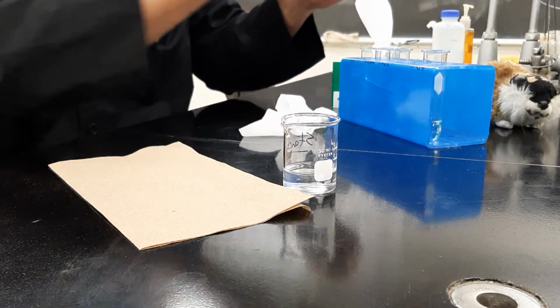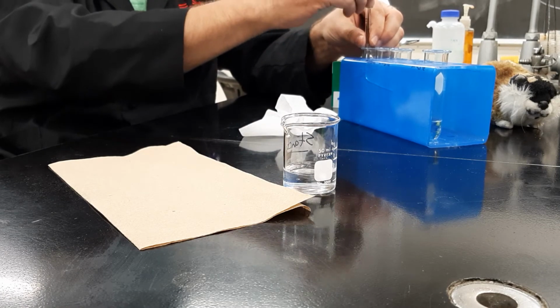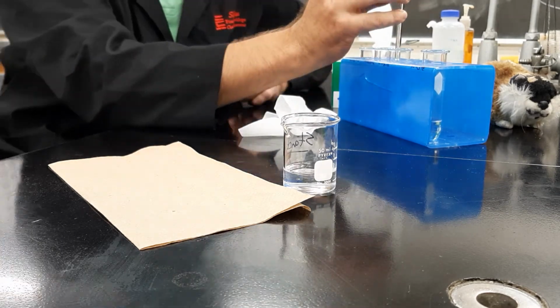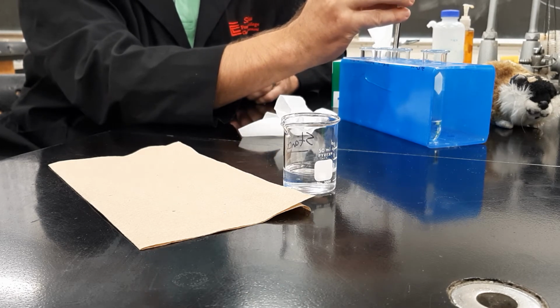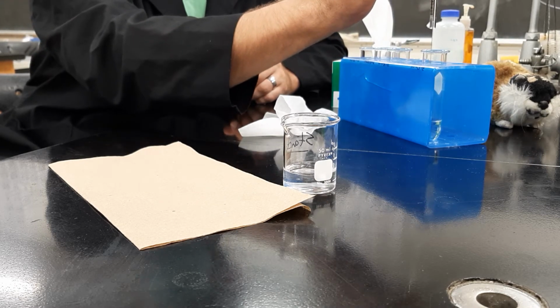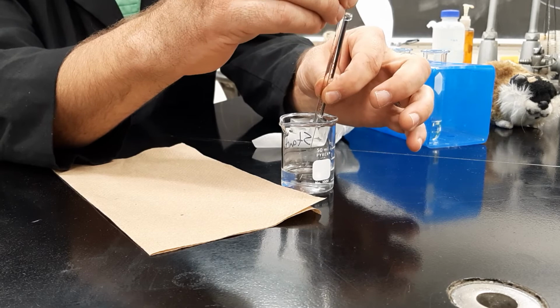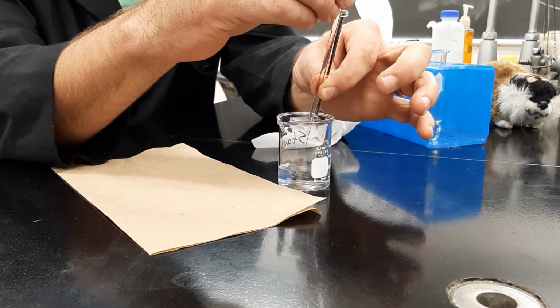The last one is this one. Same thing. These are also, your technique is optional. The 2-finger technique is pretty good that I've been demonstrating. But you can also choose if you want to use a one-handed technique, and you can use 2 fingers on the plunger like that. If you're doing it a lot, you can try to master that. That's totally fine too. And when you go to use it, then this one, it's even more important to clear the air bubble because they get almost impossible to clear from this.